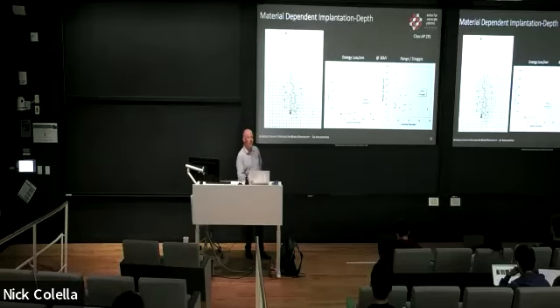So whenever you prepare a TEM sample, right, you need to be aware that when your TEM sample is, say, 100 nanometers thick, underneath both surfaces, you have a defect zone on the order of 10, 20, 30 nanometers. Right? So that means when your defect zone is 30 nanometers, then you have suddenly only 40 nanometers of pristine material left over.